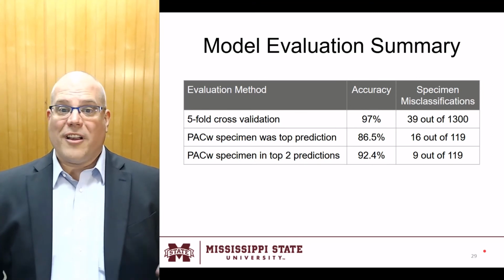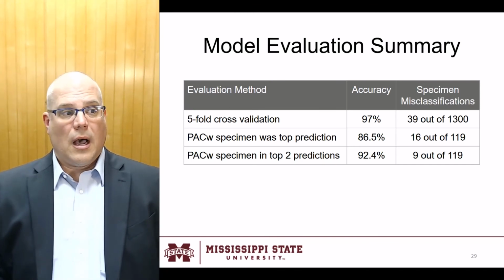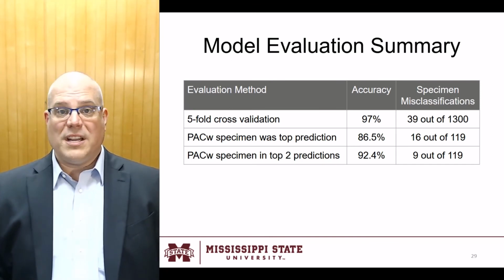Here's our model evaluation summary. Again, the 5-fold cross-validation had an accuracy of 97%. PacW specimen was in the top prediction, 86.5%, and PacW specimen was in the top 2 predictions, 92.4%.